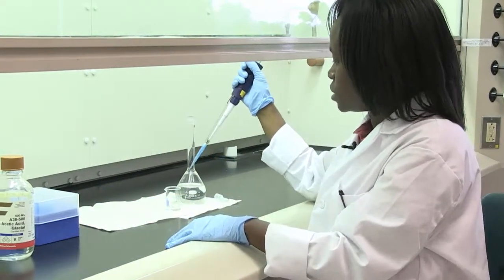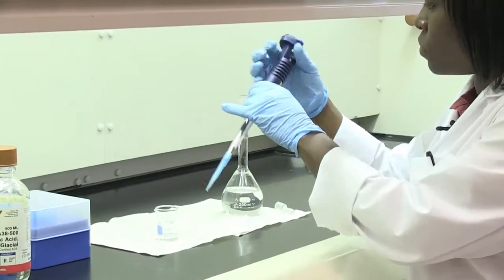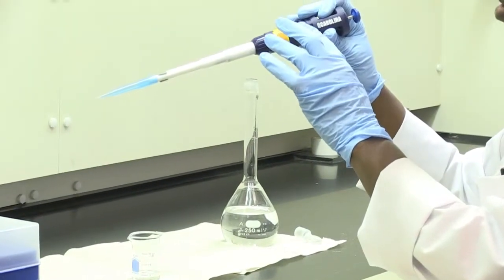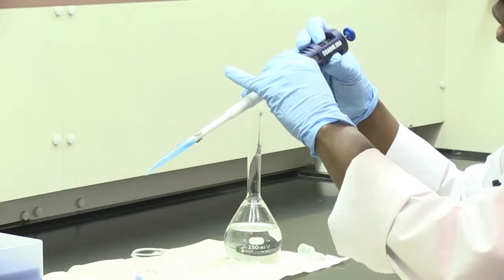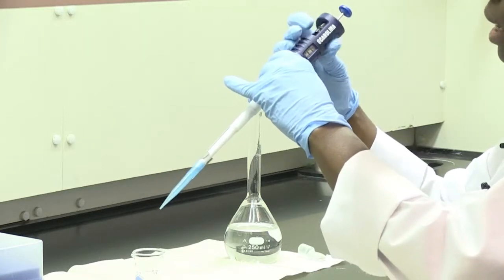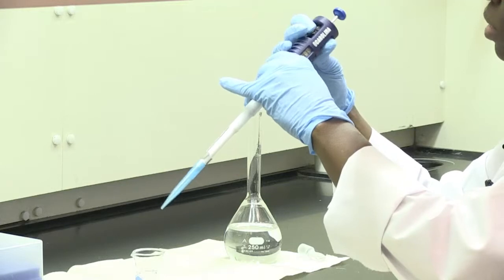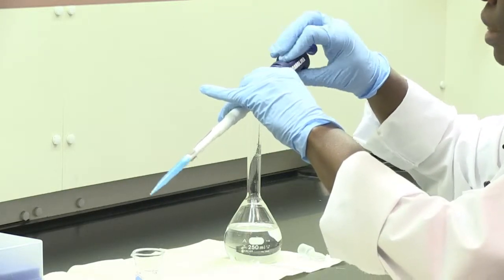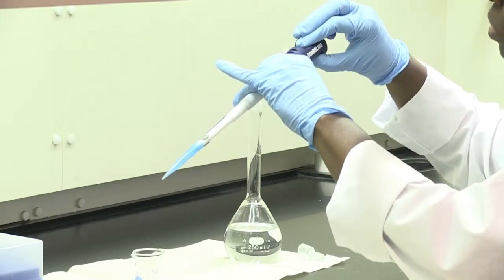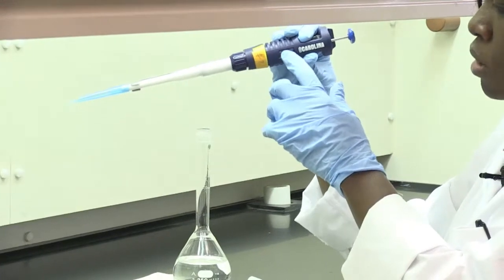I have already placed some of the acetic acid in this small beaker, and I'm going to use this to show you how to take out your acetic acid. The micropipette comes with these dials. When you shift the dial to the 1000 position, it tells you that you're going to be pipetting out 1000 microliters, or 1 mL, of acetic acid. We're trying to get 1.429 mL, so you'll pipette out 1 mL first. You move the dial until you see a 1 in red, then 00 in black — that tells you you're at the 1000 microliter mark.